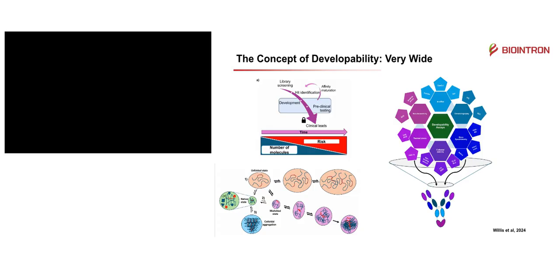On this page, you'll see the green box called developability assays. They are a combination of different things. I think the resolution is a little bit low, but you'll get the idea: chromatography, thermal stress, mass spec, colloidal stability and manufacturability, and in silico testing.